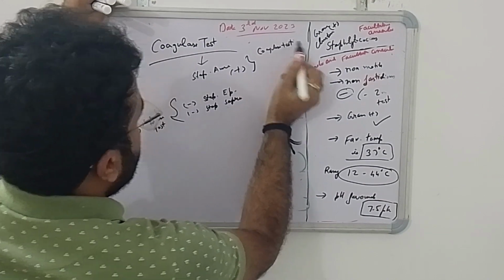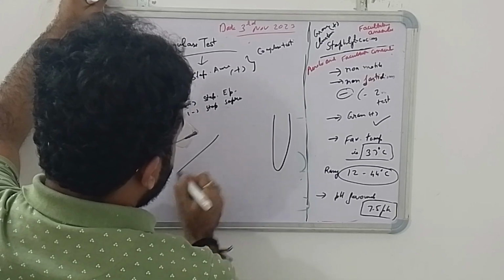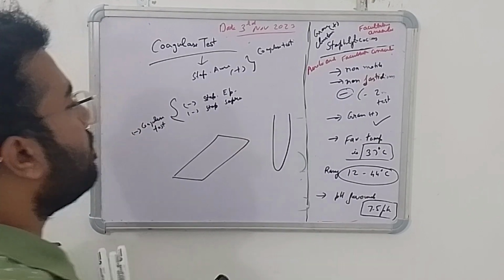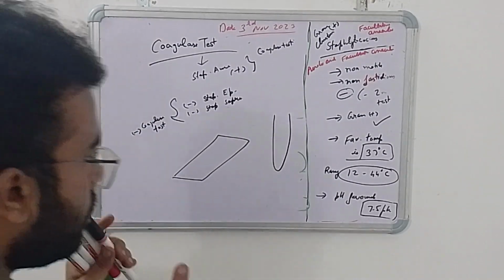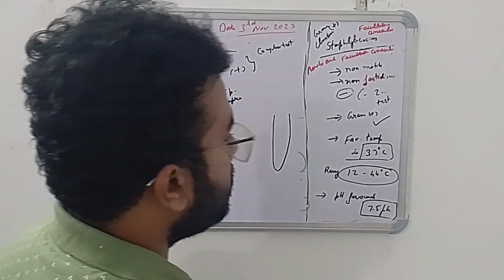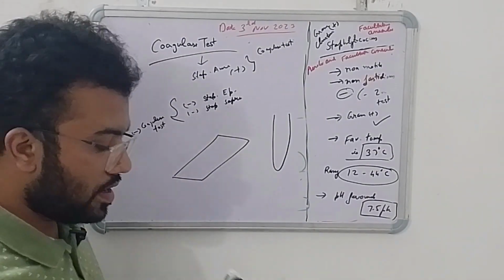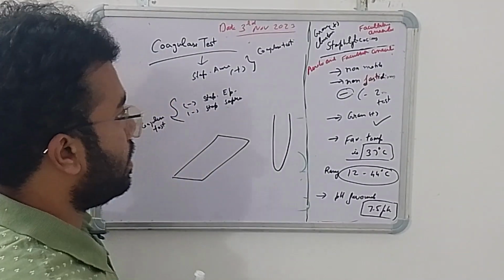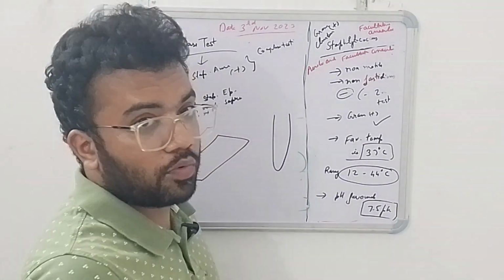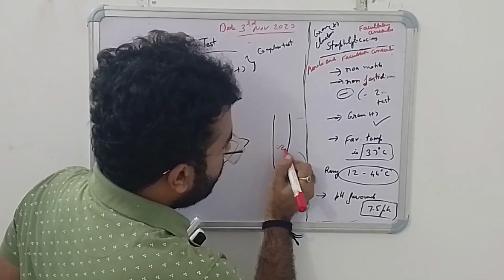What is the coagulase test? For the coagulase test we will use a test tube and a slide. We look for the presence of free coagulase in the test tube, and you see some colonies and detect a gram positive infection of Staphylococcus, and it is catalase positive. The indications point towards gram positive, catalase positive, coagulase positive. So for example, it is a free coagulase.